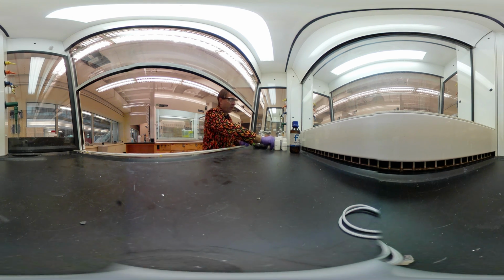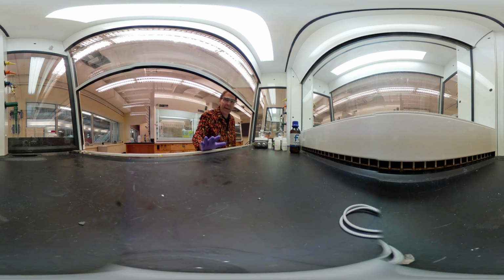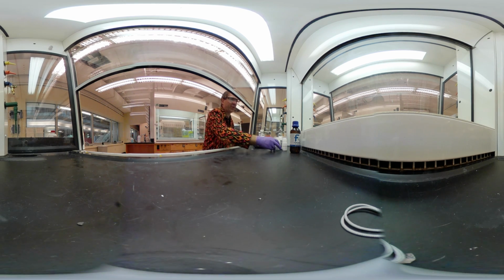Now, a very important thing here is to have very vigorous stirring. So I've got those weather vane micro stirrers. These are 50 mil round bottom flasks that I've got going here. Now, one of the other things we need to add to this is some potassium bromide. But we don't need very much KBr. Bromine's very heavy. So we need 0.002 grams. It's essentially impossible to measure that small of an amount on the scales that we have.